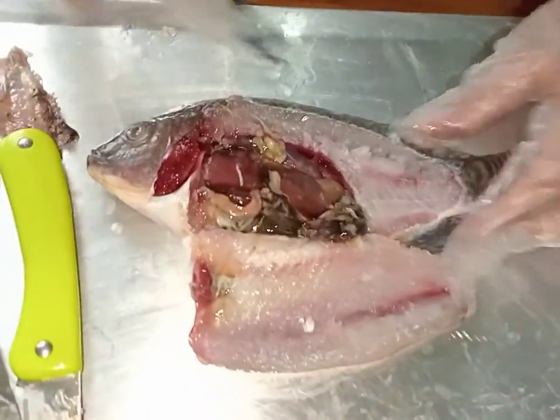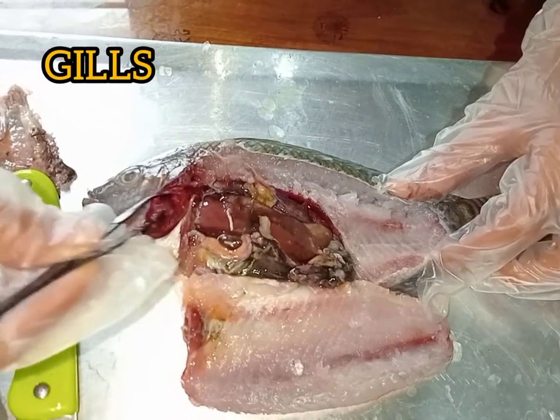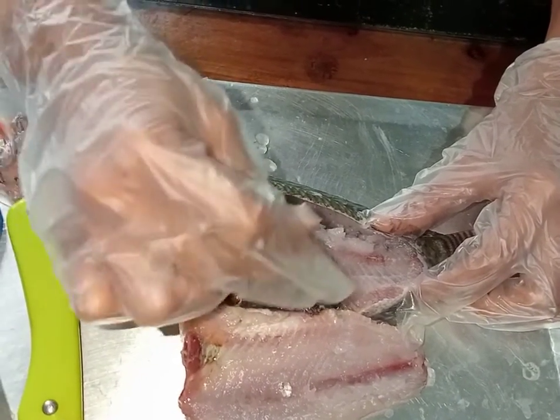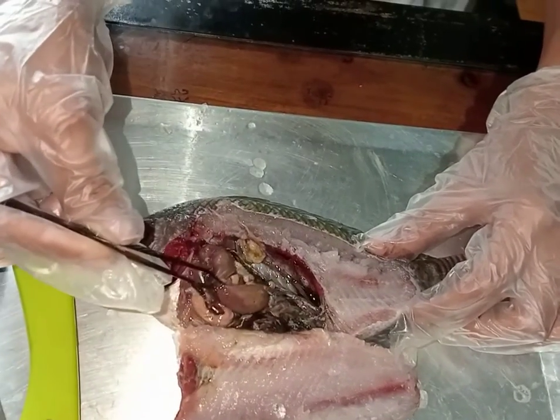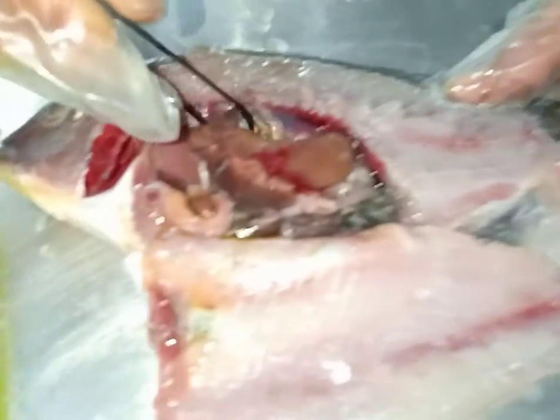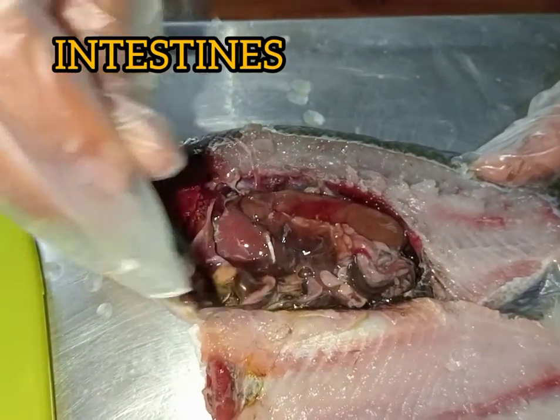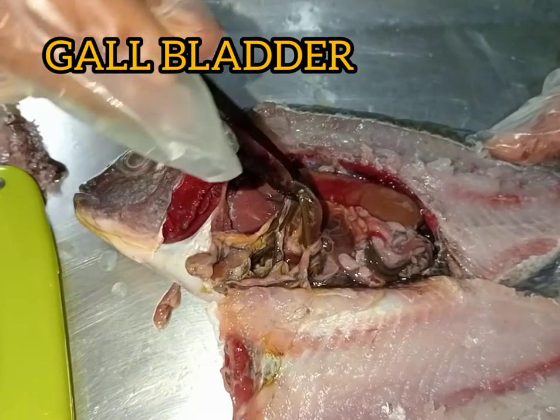This is now the internal parts of the tilapia. First is the gills, and we have here the liver, and we have here also the swim bladder, and the intestines of the tilapia, and the gallbladder.